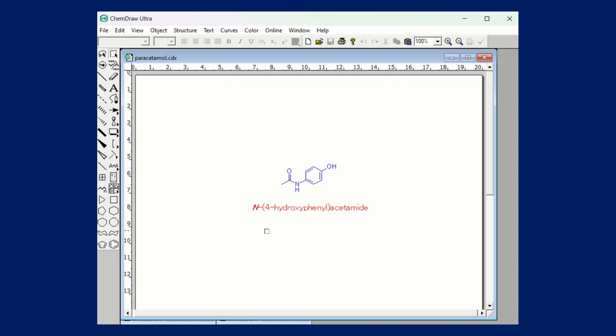So these are the different options available in ChemDraw. This is an older version of ChemDraw, so we can draw only the 2D images for a molecule. Now let us see another molecule. Draw the structure of something like this.